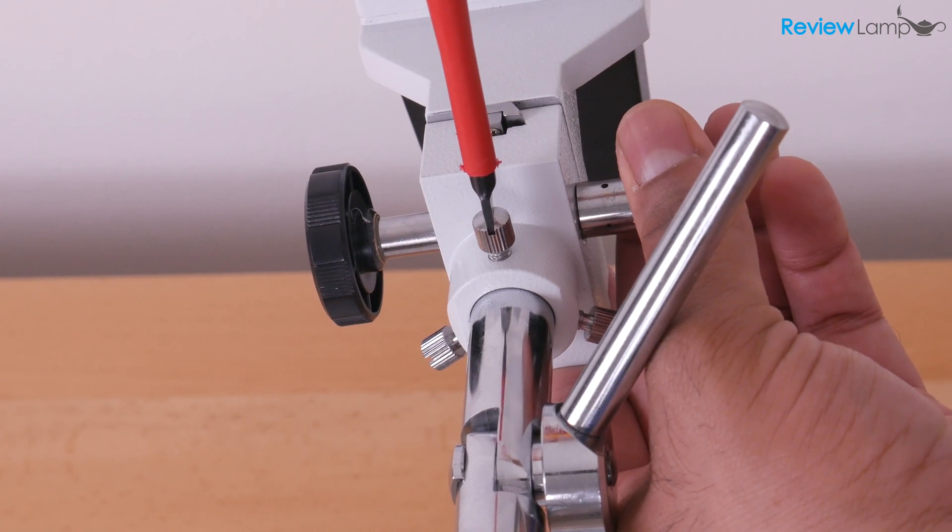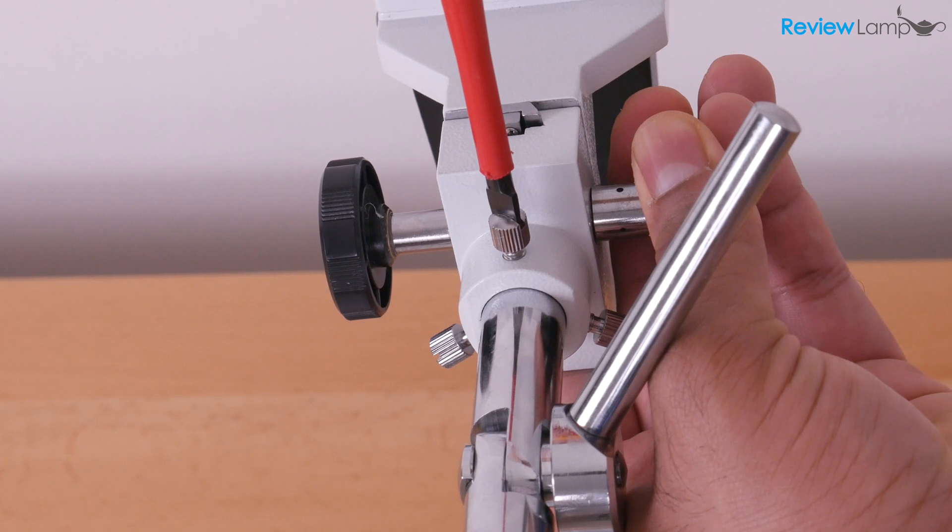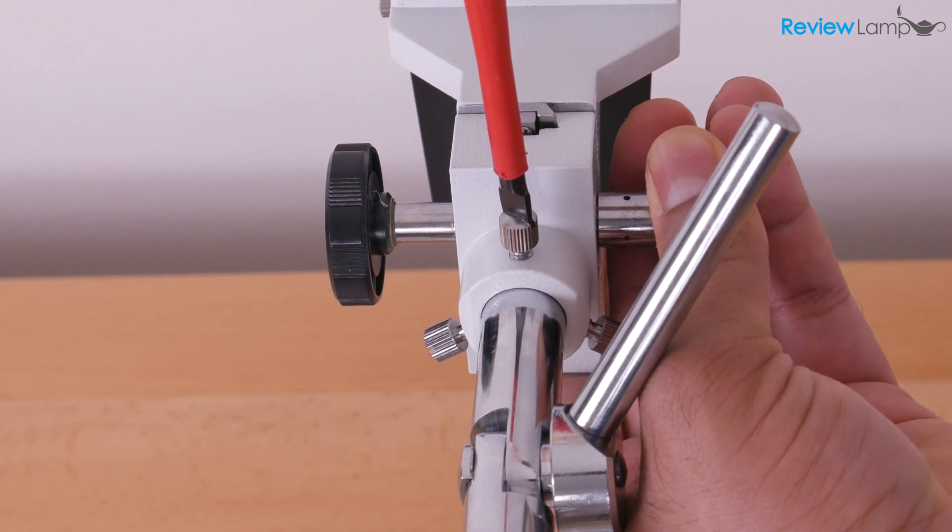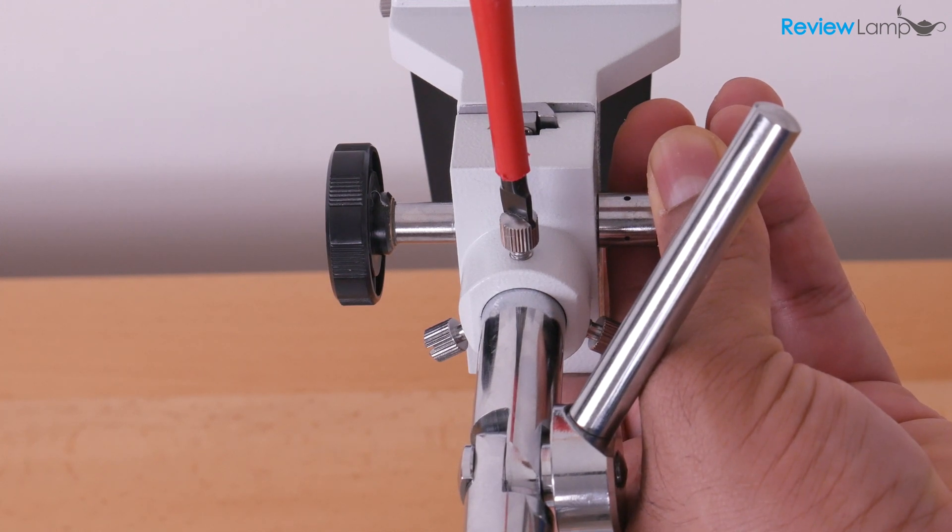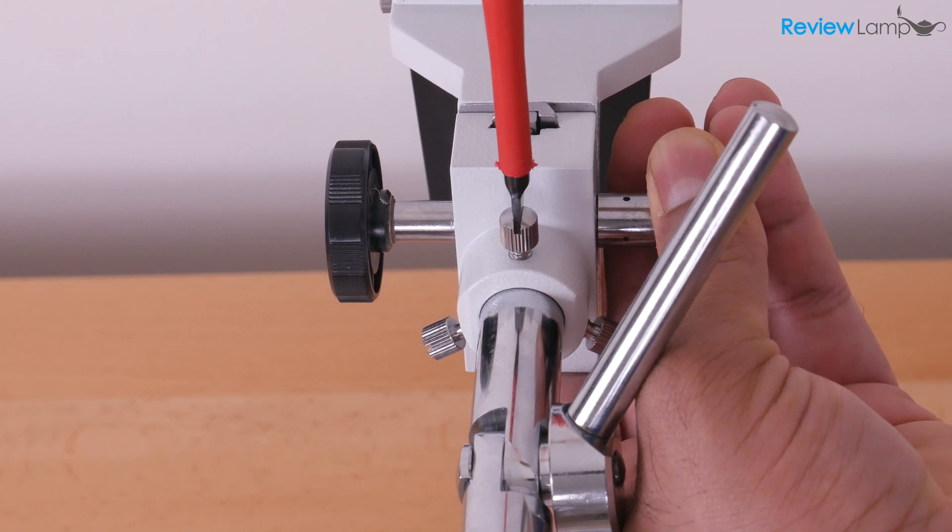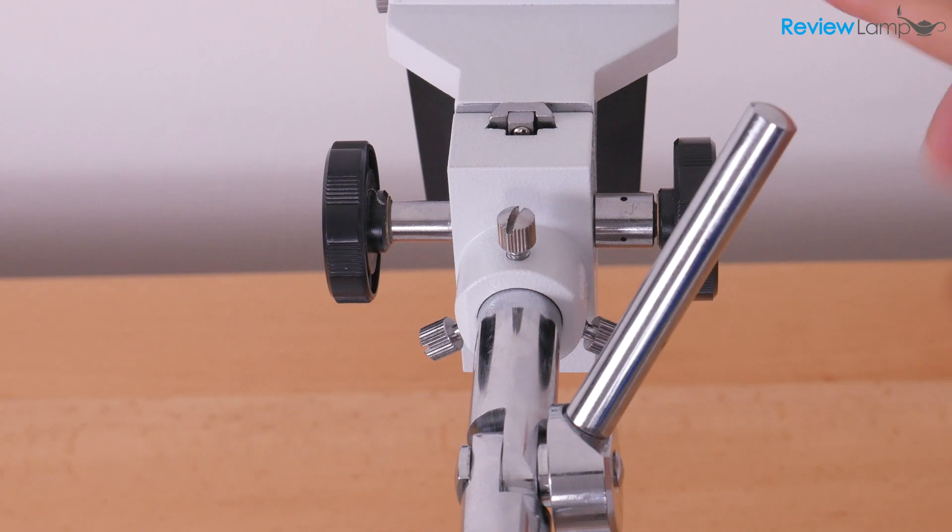So grab your flat screwdriver, insert it, turn it counterclockwise till it loosens up, and then gently adjust the microscope head to where you think is about level. Obviously you can use a level if you want to be perfect, but I'm just going to eyeball it for now. And it looks horizontal enough to me. And when you're ready, tighten that screw back up to ensure that the head stays in place.